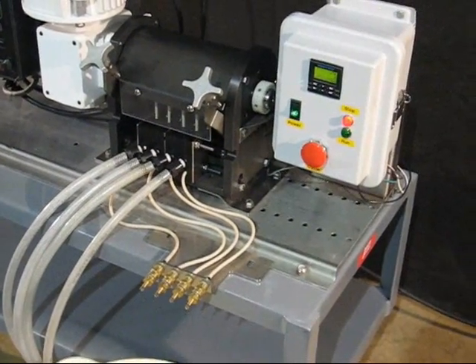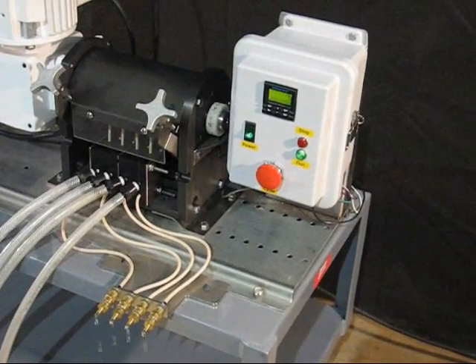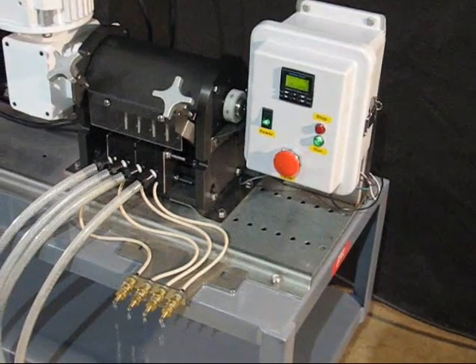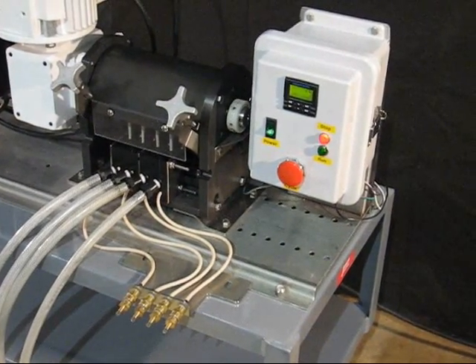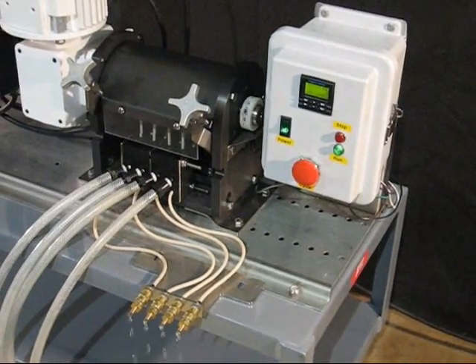Doses up to a million pulses can be programmed, which would allow multiple day runs if necessary, with automatic shutoff at the end of the dose.